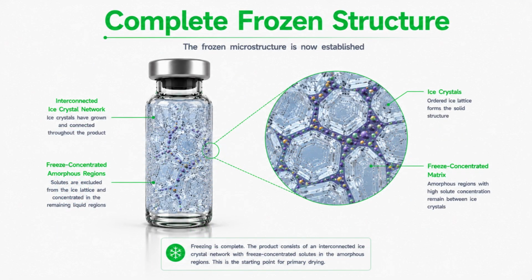The final frozen product is not simply ice. It is a highly organized microscopic architecture consisting of ice crystals surrounded by freeze-concentrated regions.